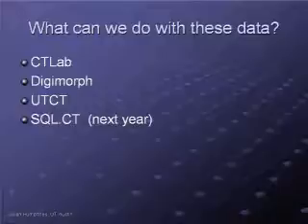And so our immediate goal was to scan those specimens and use visualization software to produce imagery and animations that let people actually see those objects in 3 dimensions. Those products are also part of our workflow. We produce animation frames and movies using a variety of proprietary applications.